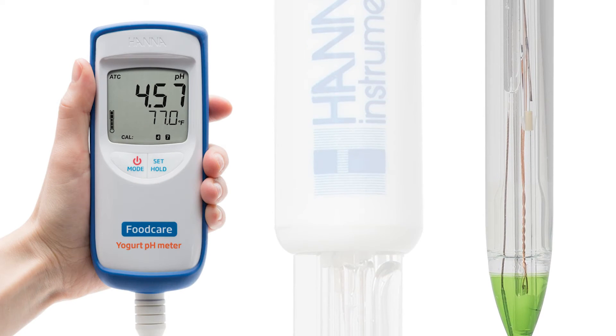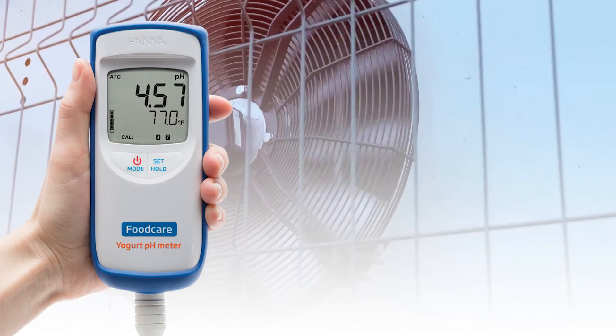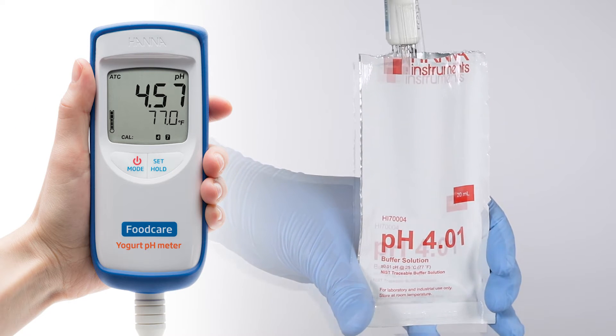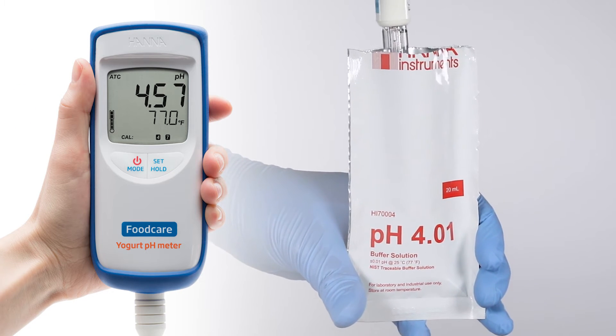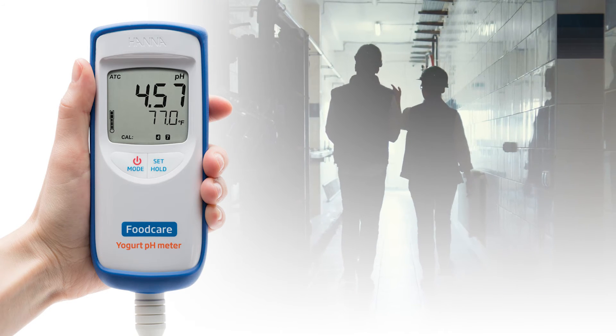Made with low-temperature glass to ensure quick readings, even in environments as cold as 32 degrees Fahrenheit, its glass body is chemically resistant, waterproof, and easy to clean, making it a perfect choice for spot-checking on the production floor.